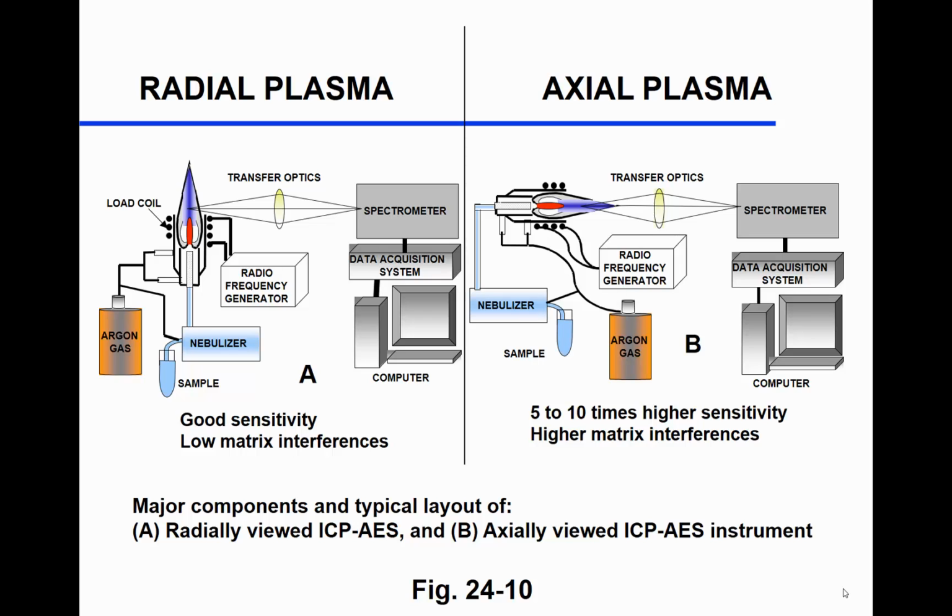The axial has to almost be more expensive because the flame is directed at the spectrometer. Yeah. It's going to need a heat shield on it. It's also going to need to be a beefier device. So I would assume that's going to be a much more expensive piece of equipment. Good. There you go. You got Andy to answer that.